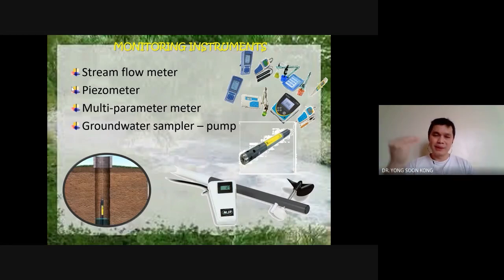The water automatically comes out. It's like a geyser where they have built up high pressure, then it presses out automatically. Those are what we call high flow sampling, which is usually not the case.